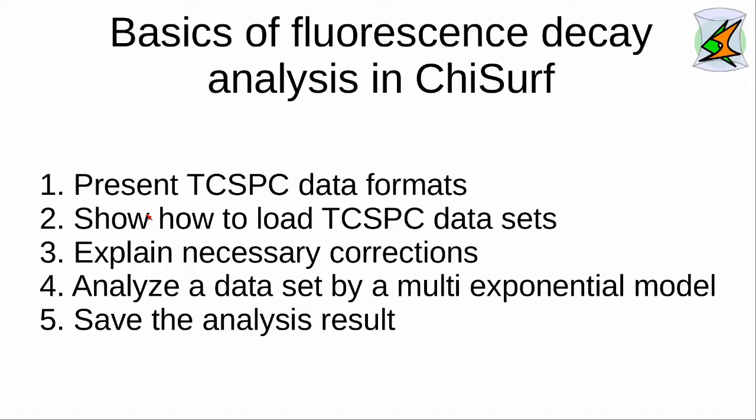In this tutorial, I will show you the basics of fluorescence decay analysis in Chi-SERF. I'll show you different TCSPC data formats, show how you can load these different datasets, explain necessary corrections for accurate fluorescence decay analysis, and we'll analyze a dataset by a multi-exponential decay model. This dataset we will save for later processing.